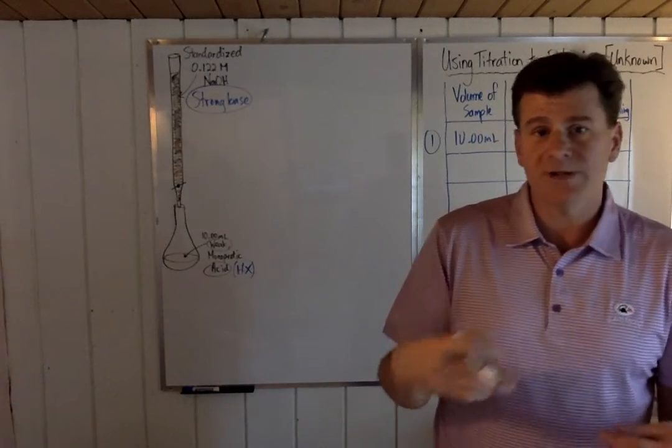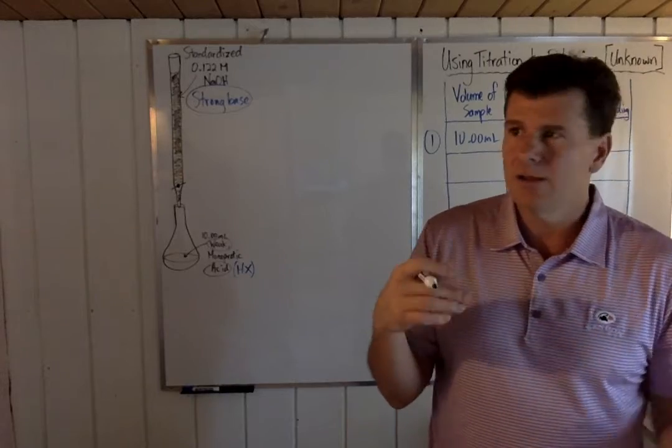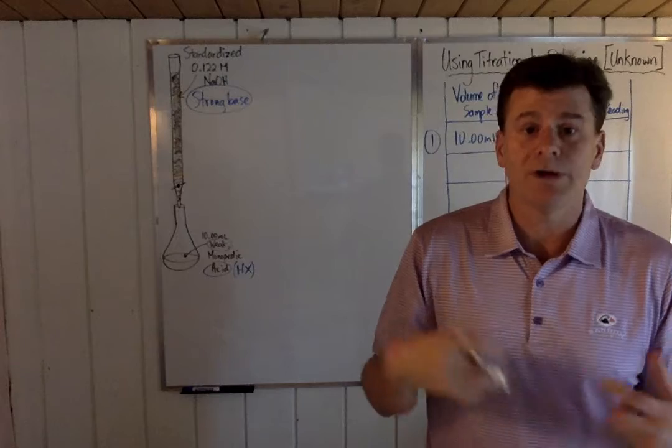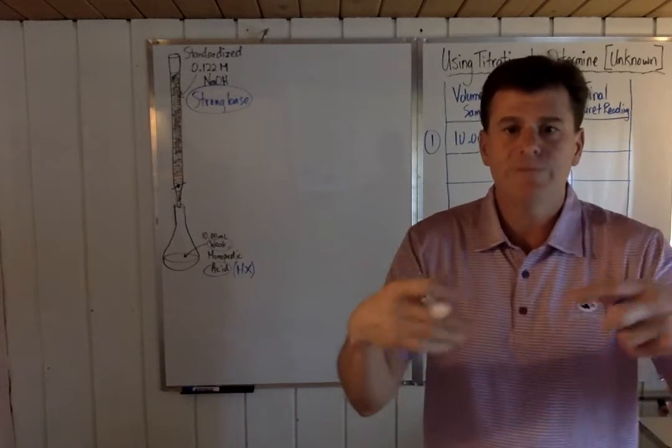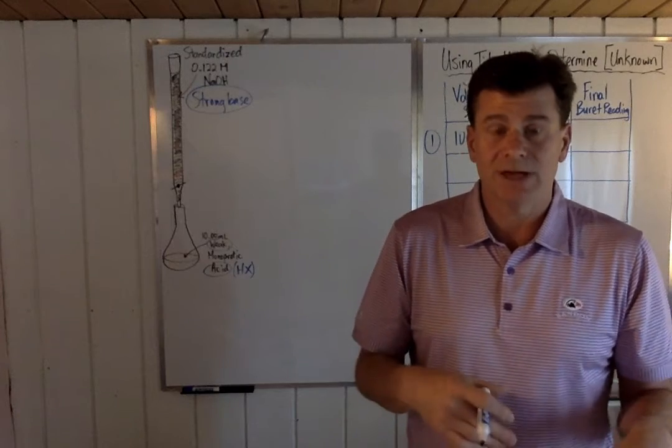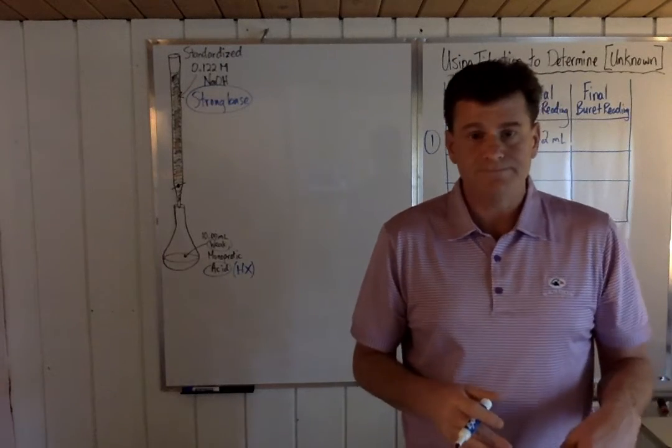Now, it's an end point because you've seen a color change. So it hasn't necessarily hit the exact theoretical equivalence point. But the end point is you visually saying, okay, I must be at the pH that is going to be pretty close to my equivalence point. So I'm going to stop right here.